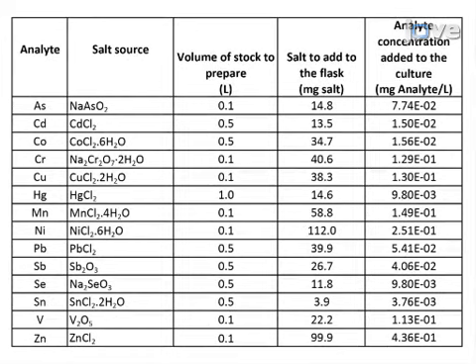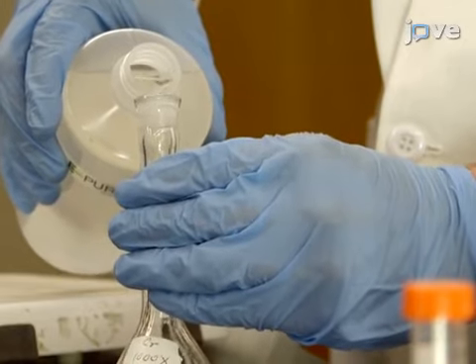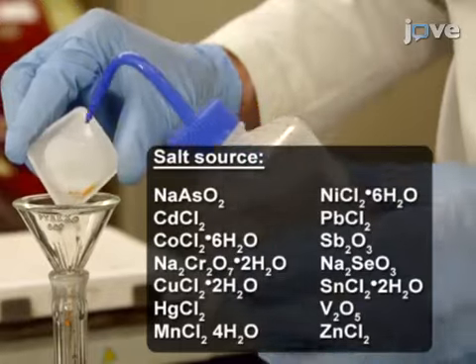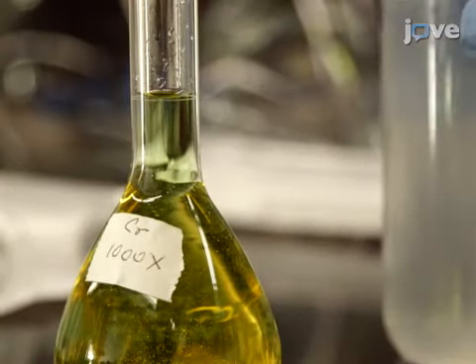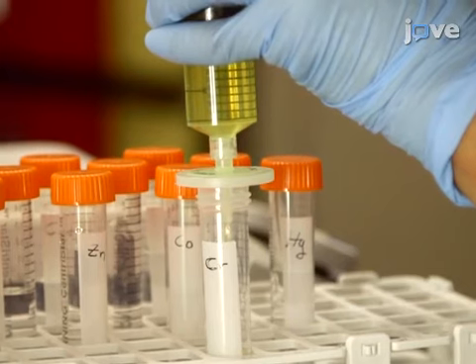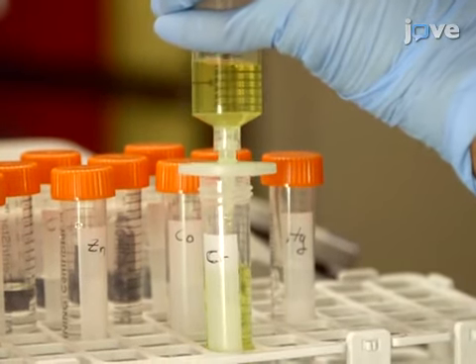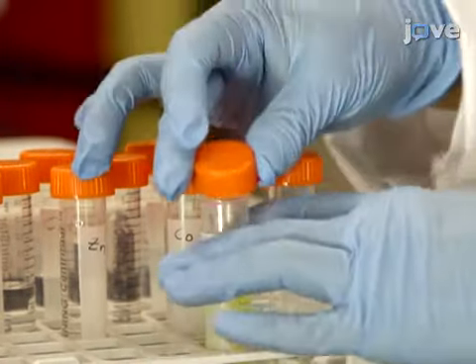To prepare inorganic contaminant stock solutions, with distilled water, partially fill volumetric flasks and add the individual salt listed here. Then, fill with distilled water to the required volume and mix thoroughly. Sterilize the inorganic contaminant stocks by passing the solutions through a sterile 0.2 micron syringe filter and collect the filtrates in sterile tubes.